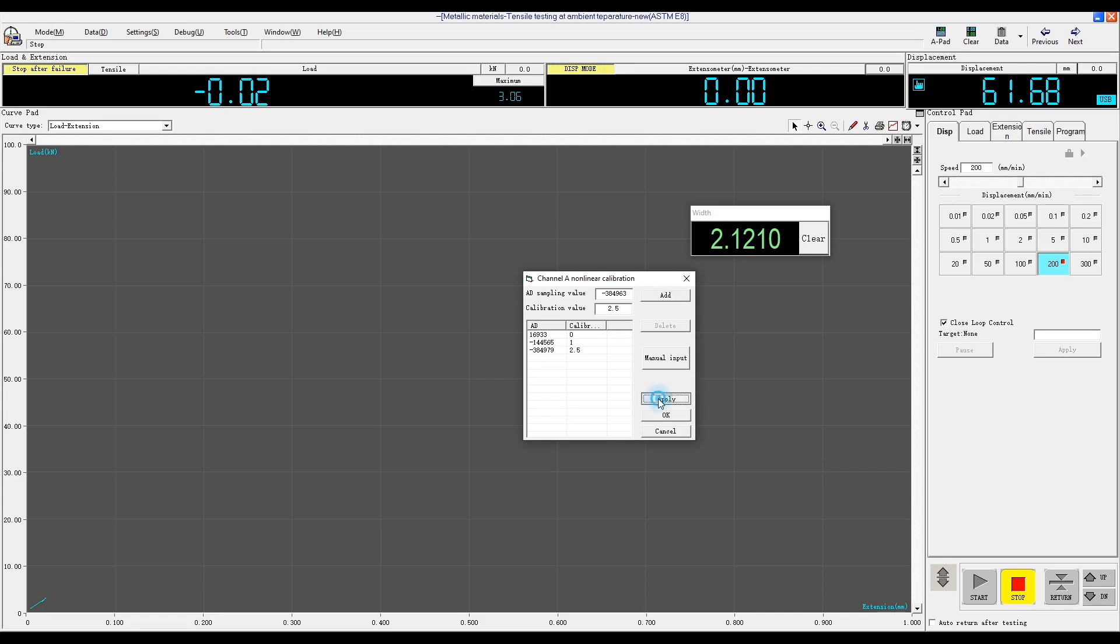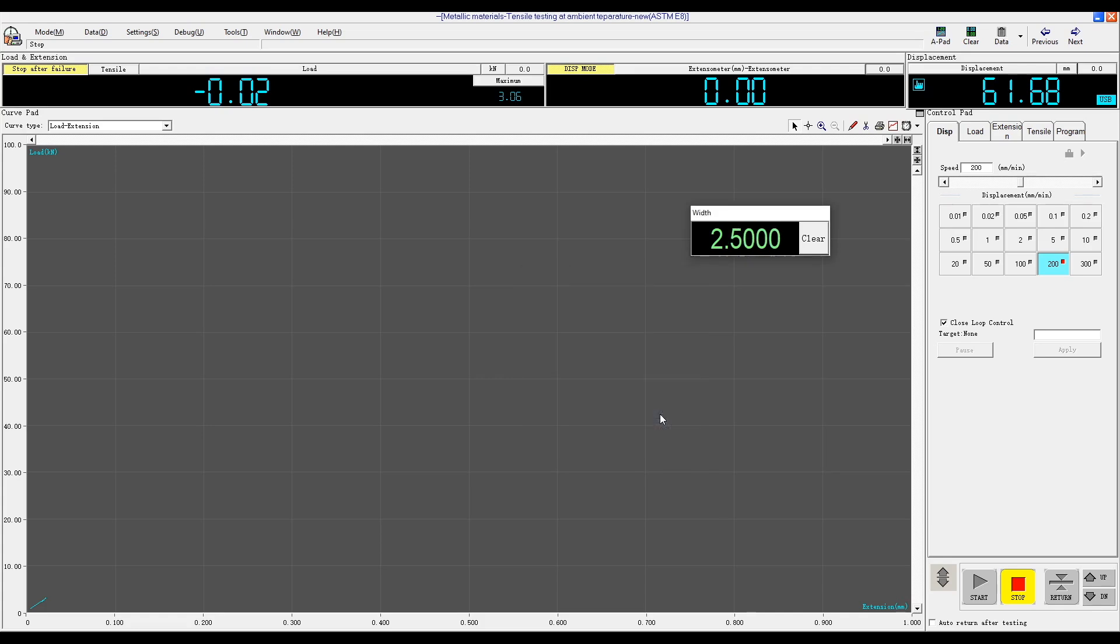After that, we can check for accuracy. 1 millimeter, 0.5 millimeters, 0 millimeters. This completes the calibration procedure.